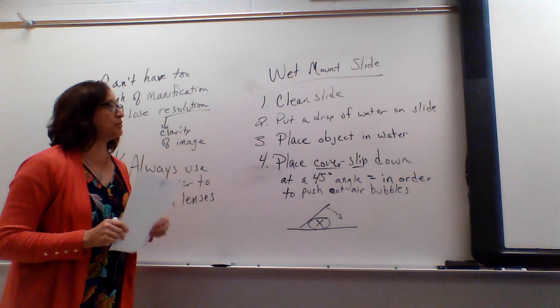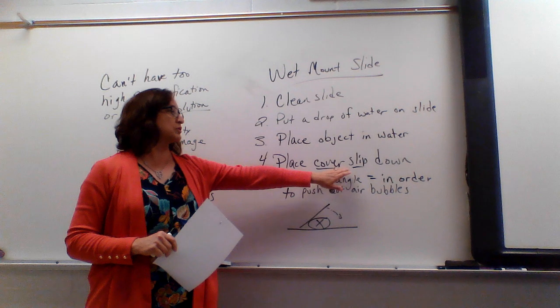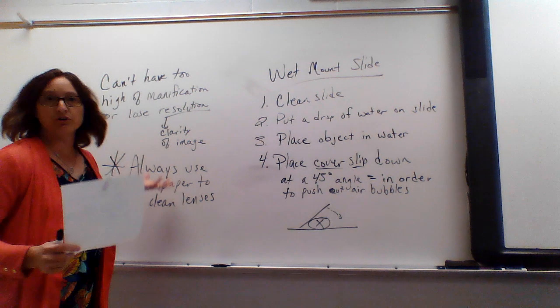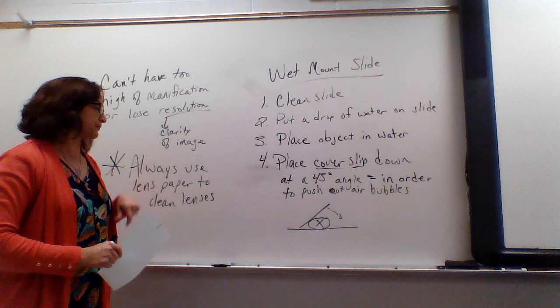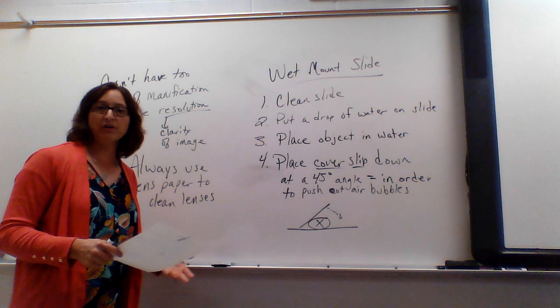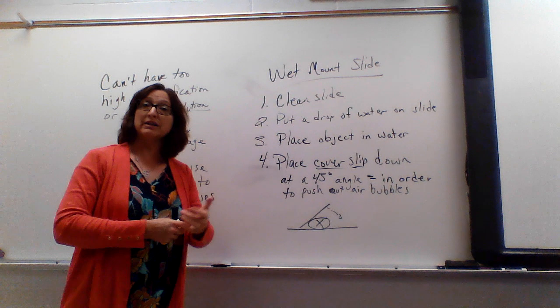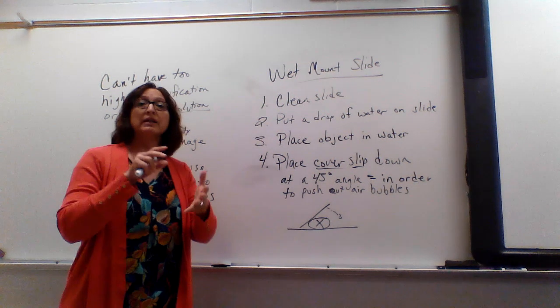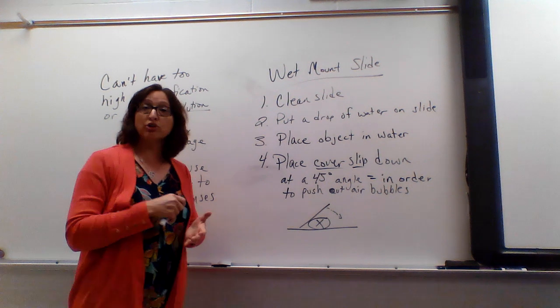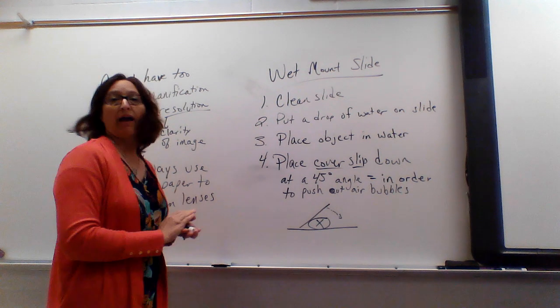Okay, so I will want to see that you've copied all these notes. You want to start studying those. Make sure you know these words: cover slip, 45-degree angle, and what you do in order. I will want you to know what resolution is, what you clean it with, how you carry a microscope, what the parts and functions are, and what type of microscope it is. It's a compound light microscope, and it's a light microscope because we use light. We're going to go over all the different types of microscopes later. And make sure you know how to find total magnification. Okay, I think that's it for now.